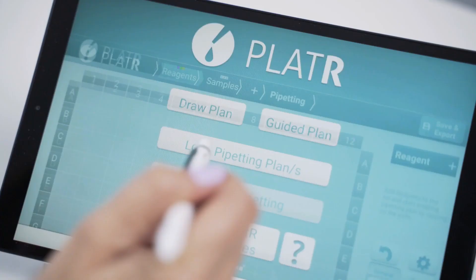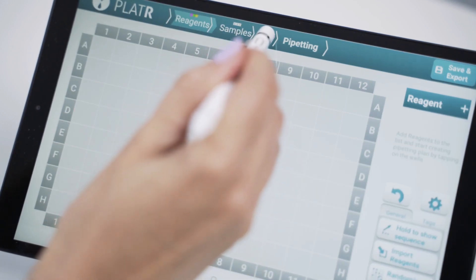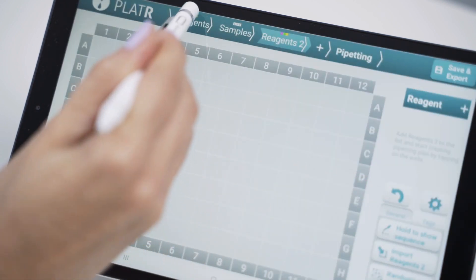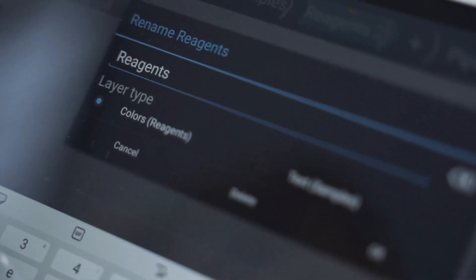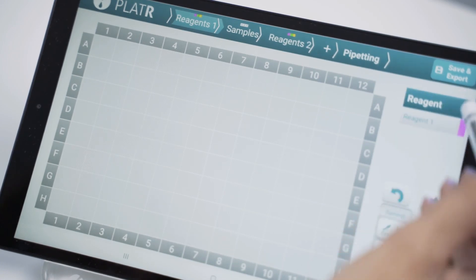Let's create one. On the Protocol Setup page, you'll find two preset layers. You can remove or add up to 12 layers. We'll add additional reagent number 2 and rename reagent number 1. To add a reagent on the plate, simply add it and swipe.